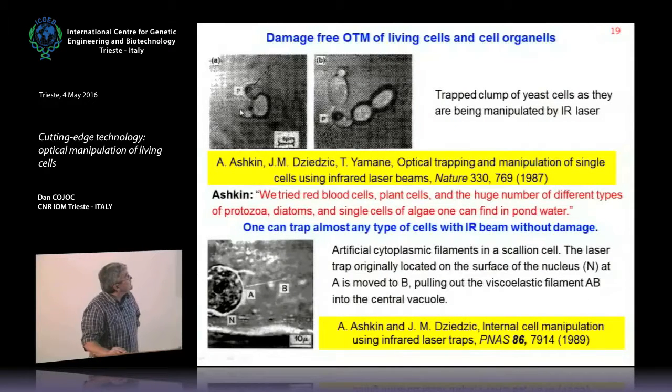Here the photos are not very beautiful by today's standards, but they are relevant because it is the first trapping of cells, yeast cells, with infrared, which is again a Nature paper. Nowadays this would no longer be a Nature paper, but it was very important at that time.